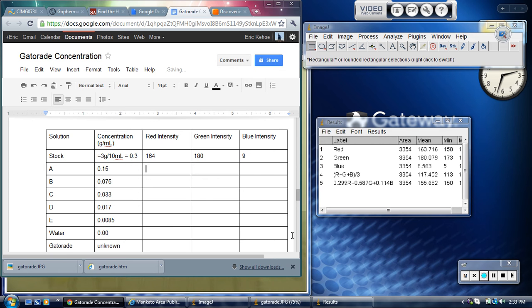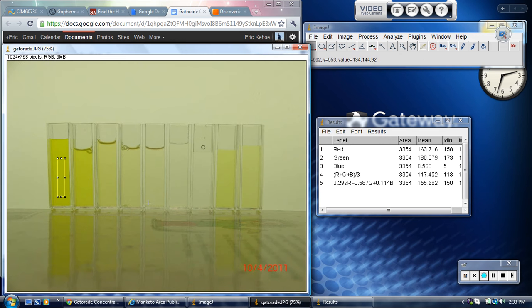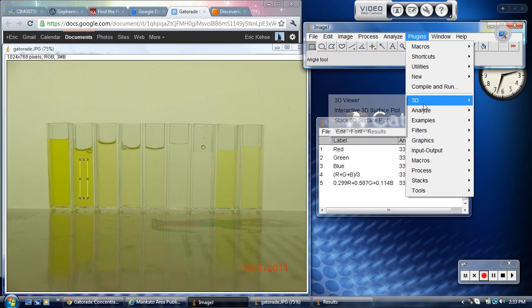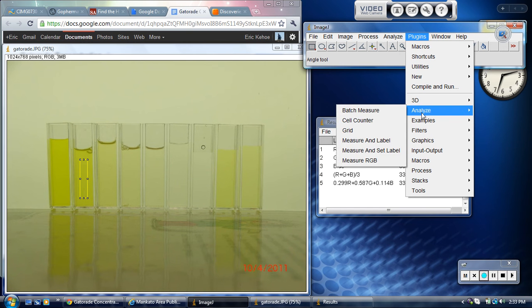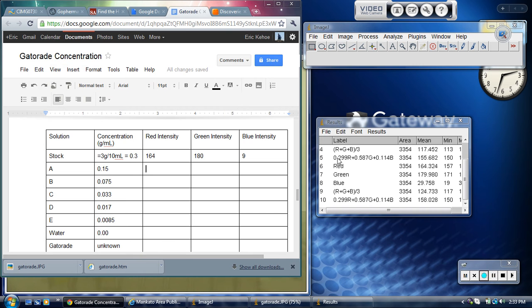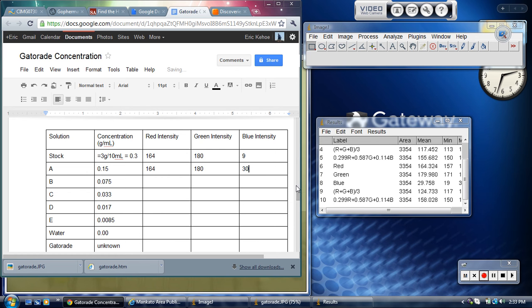Then I'm going to take and I'm going to move my box. Try to keep your box the same size by clicking the middle, just drag it on to the next sample. Again, go Plugins, Analyze, Measure RGB, and it will give you a new set of values. Now you can see my red value here is 164 still. My green value is still about 180, and now my blue value is about 30. You don't expect the red and the green intensity to change much because something that's yellow is letting red and green light through and it's absorbing blue. So the more yellow it is, the more blue gets absorbed. And the less yellow it is, the less blue gets absorbed.